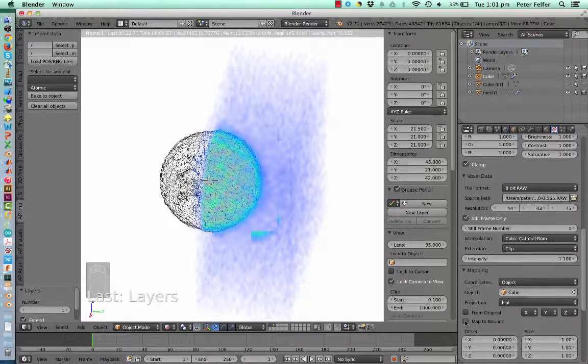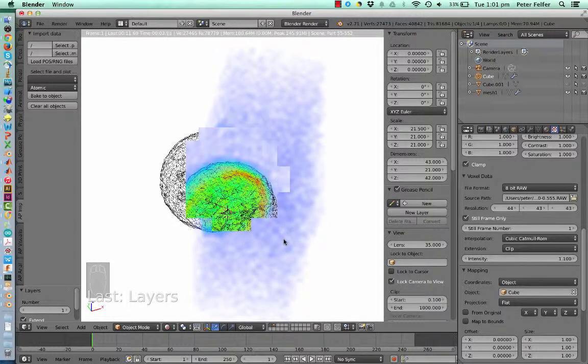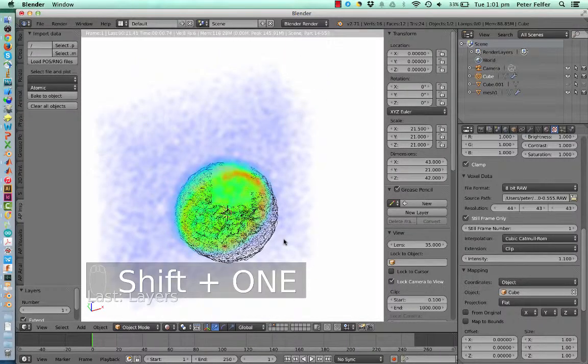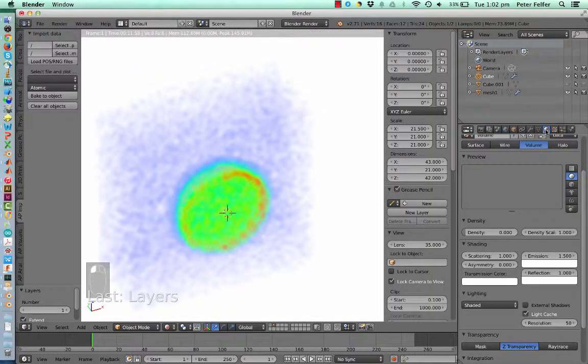This also explains why, when I was playing around with the coloring earlier, we didn't quite see the excess that's happening at the boundaries. So that's actually now what it should look like, and I think that's a pretty attractive render. So you can do that, of course, with or without the mesh. And yeah, that's all the trickery when it comes to the volume displays.